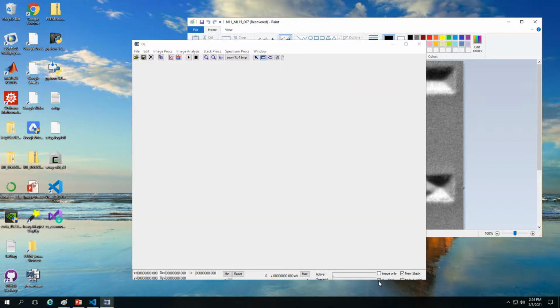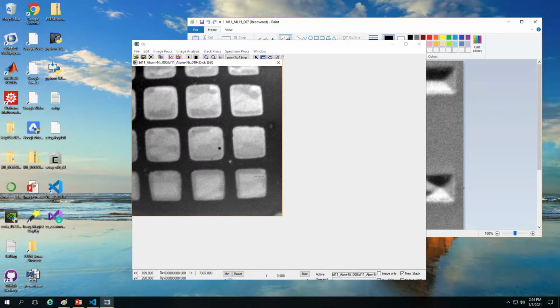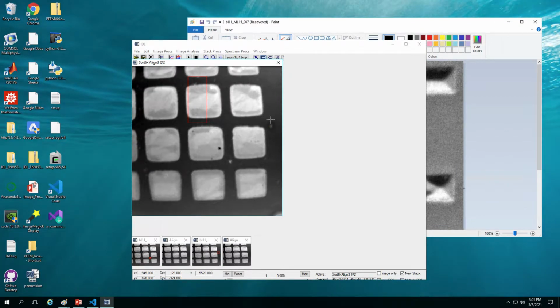Just double check you have use ROI clicked. The reason we need it is that we could do alignment. By alignment, you usually pick some dust or some artifact. Usually it's dust when you're imaging on the substrate. Don't pick anything on top of the magnetic structure, because the magnetic signal, the XAS contrast, would change as we flip the polarity of the X-ray, so it doesn't make sense to use that for alignment. So we want some stationary non-magnetic object. Okay, so now we have aligned everything.